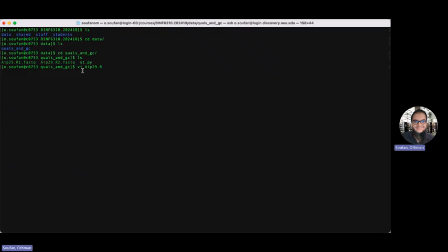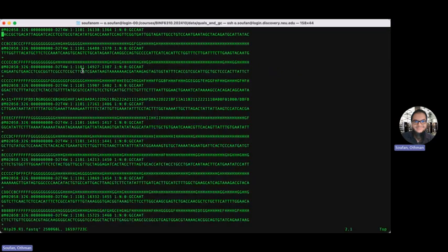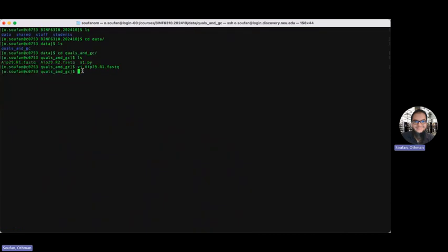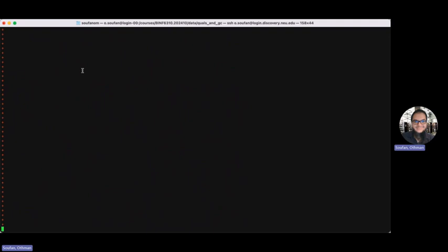So let me open the r1.fastq file, and this is the file here, okay? So it has a group of reads. I can do something like grep the plus sign, or add, and know how many reads we have here. Let me say, I guess I should say -c. Okay. 60,000 reads roughly. It's not a big file, okay?